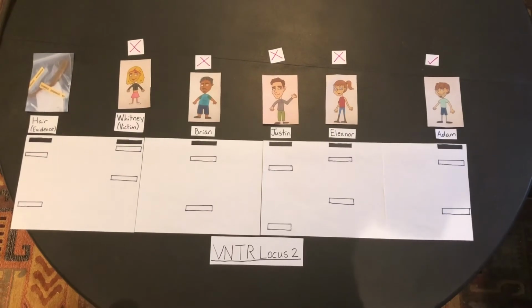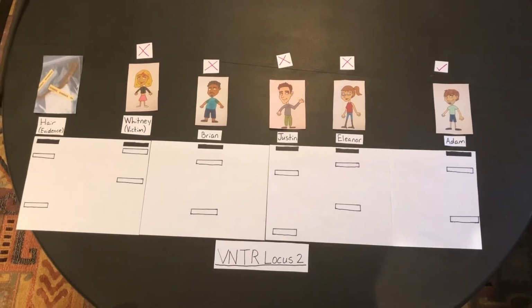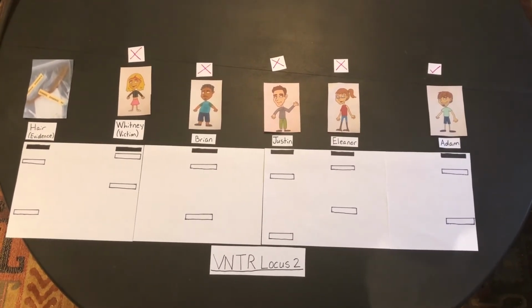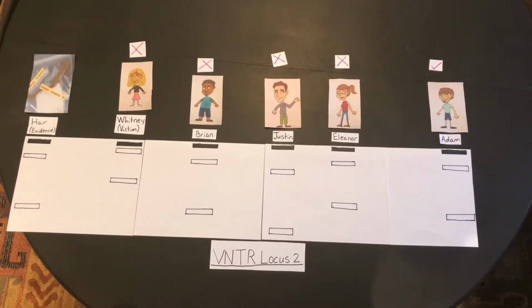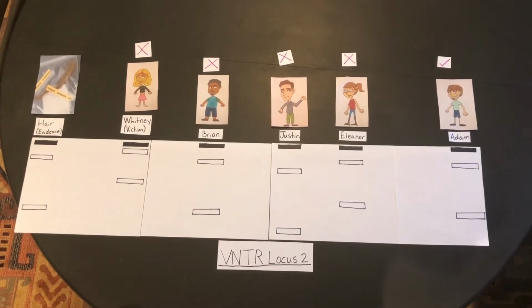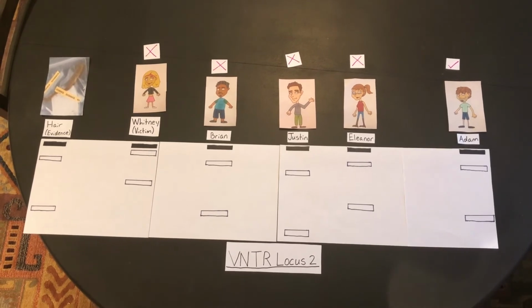In VNTR locus 2, we can see that the loci of the alleles are different in comparison to VNTR locus 1. This will help narrow down which suspect could be the culprit. In locus 1, we saw that Whitney's alleles match with that of the evidence. However, in locus 2, we see that the alleles do not match, so now we can exclude Whitney from leaving the DNA evidence. For Brian, we can already disregard him from leaving the DNA evidence since his alleles did not match at locus 1.